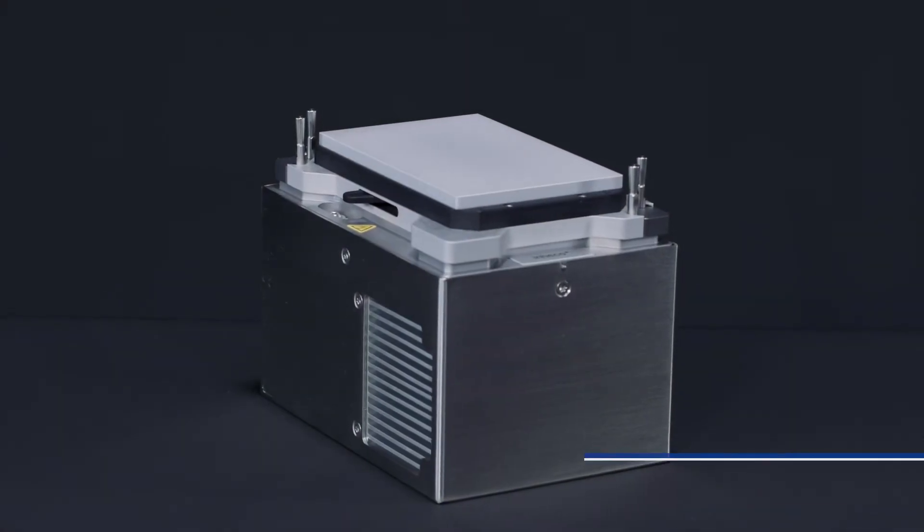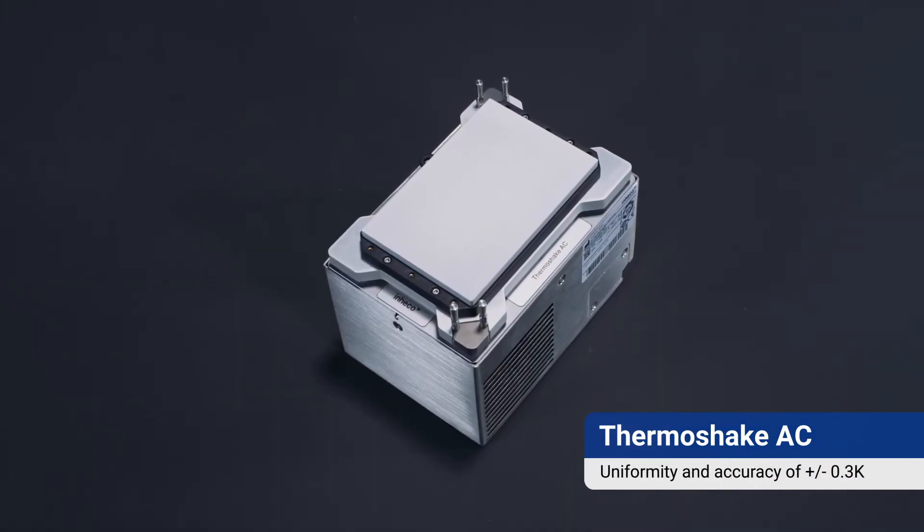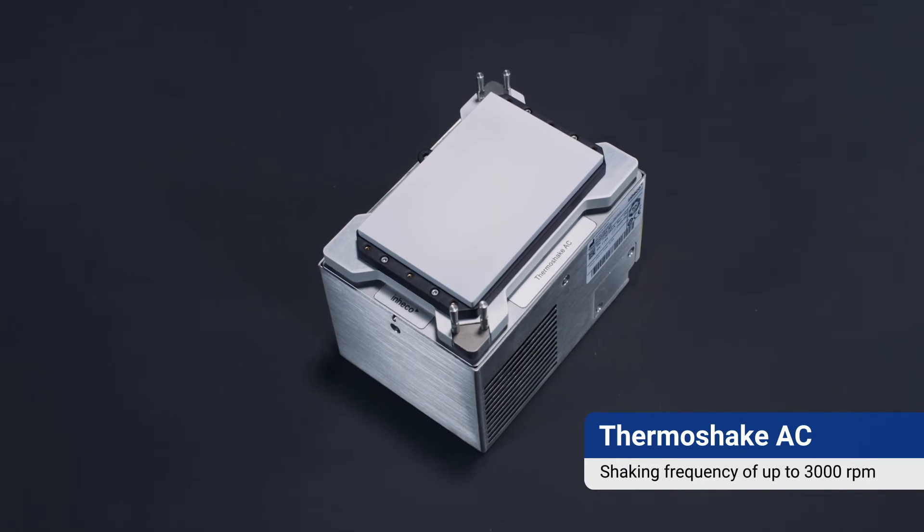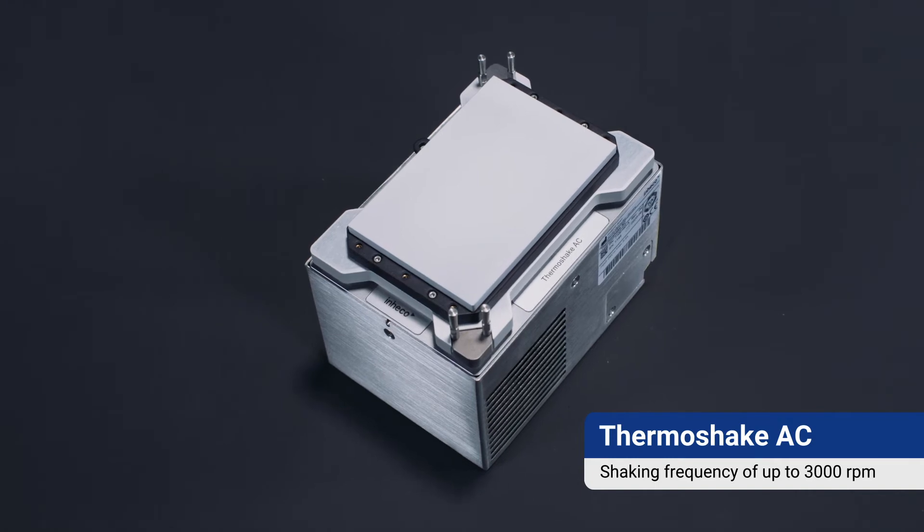With a temperature range of 4 to 70 degrees Celsius, uniformity and accuracy of plus minus 0.3 Kelvin and shaking frequency of up to 3000 RPM, the ThermoShake is an unrivaled performer.